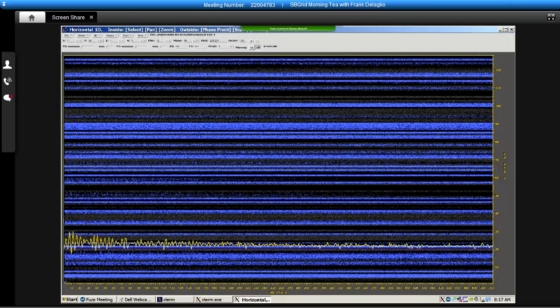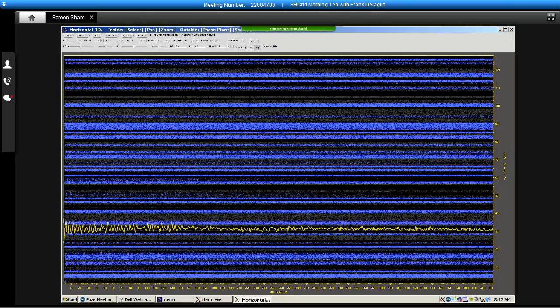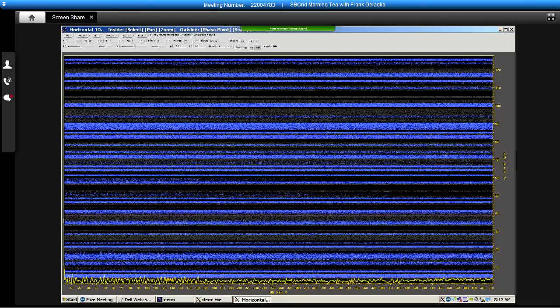What I'm doing right now is pressing and holding the left mouse button and dragging it through the spectrum so that I can see different 1D slices. And if you look closely, you may notice that as I drag through the slices, the slice number is displayed in the command panel.